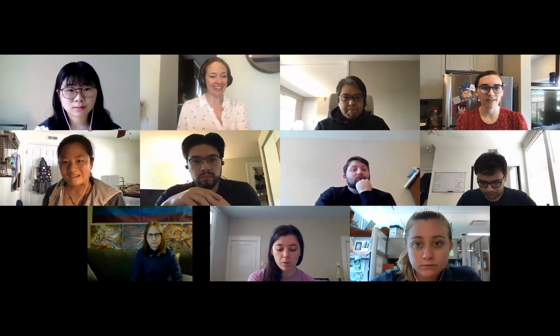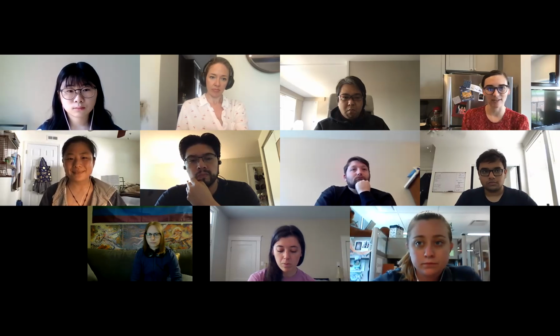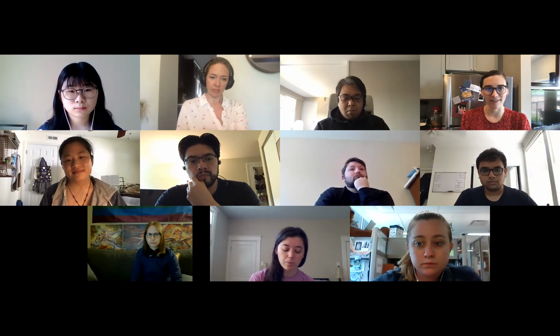It did, thank you. Any other questions? Yeah, I have one, also about the reference genome. What if there's a lot of overlap between the cell types in your reference? I'm just thinking about how quadratic programming works with this idea of linear combinations of all of your discrete cell types. What if there is not a lot of discreteness? Does that make sense? Yes.